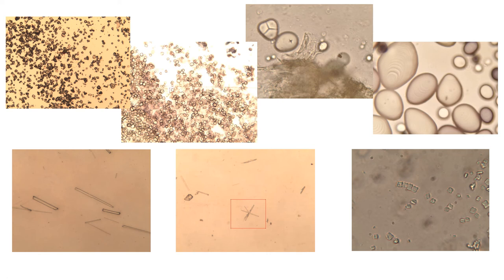Under the microscope, starch grains appear distinctively by type. Rice starch grains are the smallest. Wheat starch grain has its own characteristic appearance. Maize starch can be identified by a Mercedes-logo-like or star-shaped hilum at the center. Potato starch grains are the largest, with a muscle-like shape and striations over the surface — a typical characteristic of potato starch.